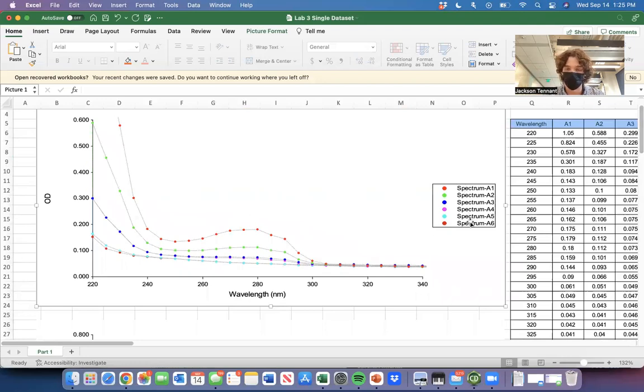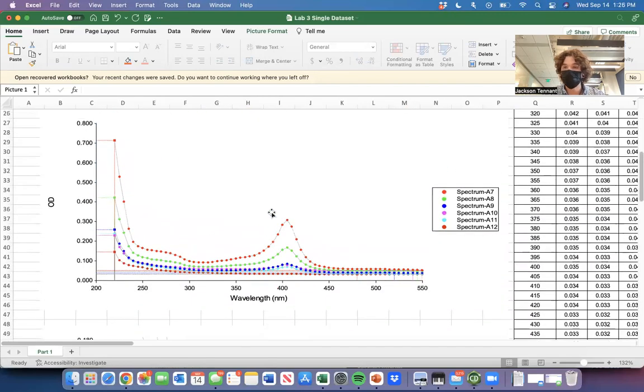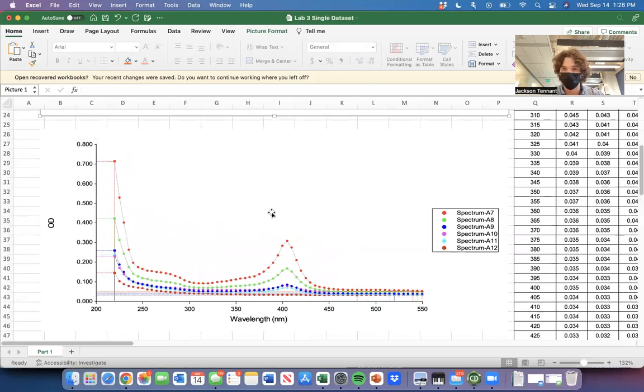We did a serial dilution. And you can see that as we decrease the concentration of that protein, so too does the absorbance at 280 decrease. This makes sense because we'd expect that if there's less stuff there, there'll be less absorbance. And if we know that stuff absorbs more strongly at 280, we can look at 280 to see that decrease in absorbance.